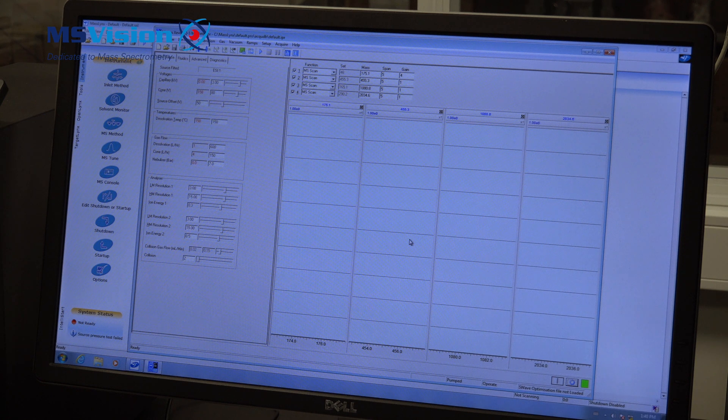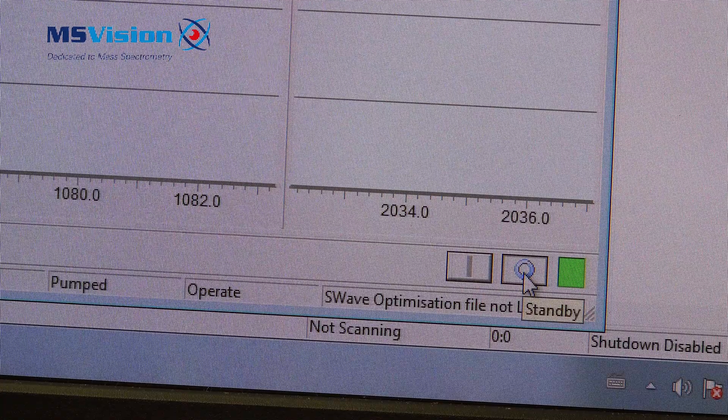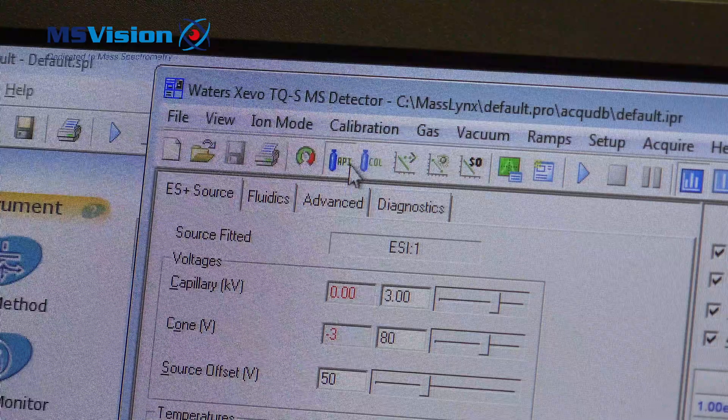For Waters instruments it is quite easy to shut down. Everything is under software control, as long as the vacuum override switch is not active, which we covered with the hardware reset. Go out of operate and turn off the gas.